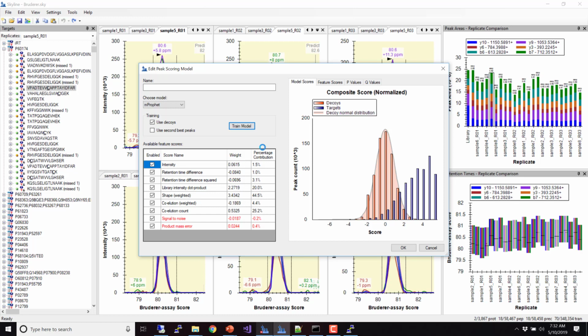Yes, you had a question. Can we keep the x-axis going further? Oh, x-axis. Yeah, it doesn't go any further. I don't know. Can you? It's fixed. Yeah, that's adjusted for that data. If there was anything further out, you would see it.